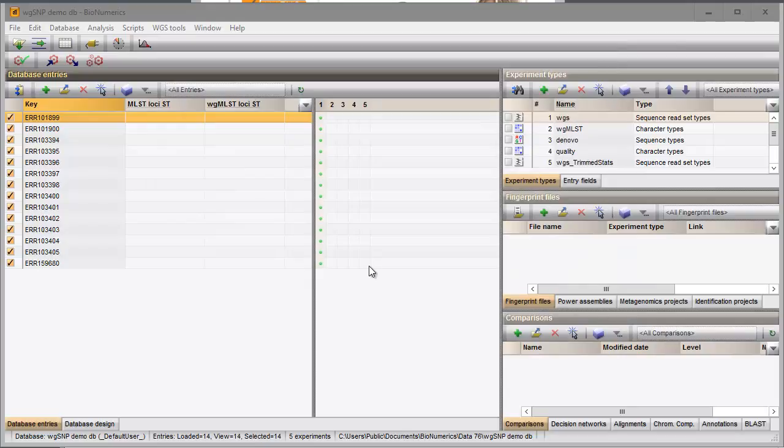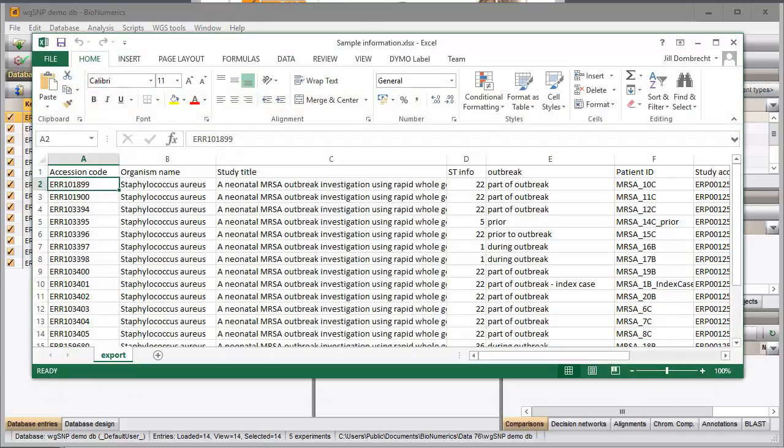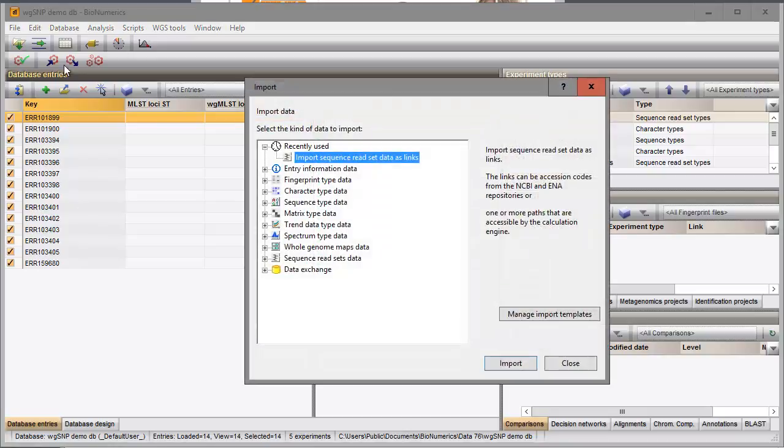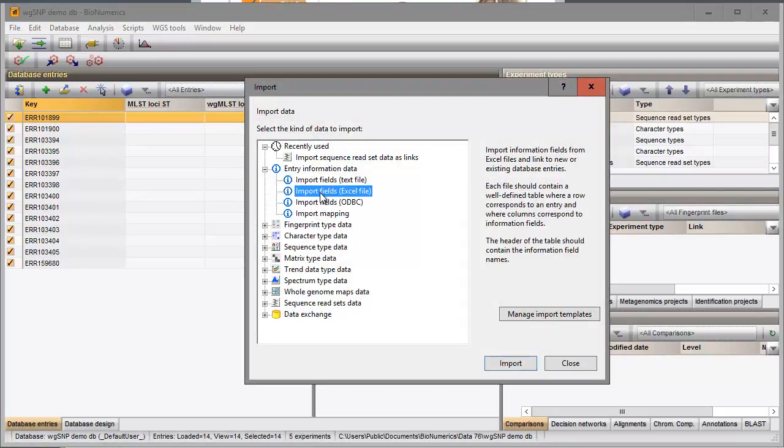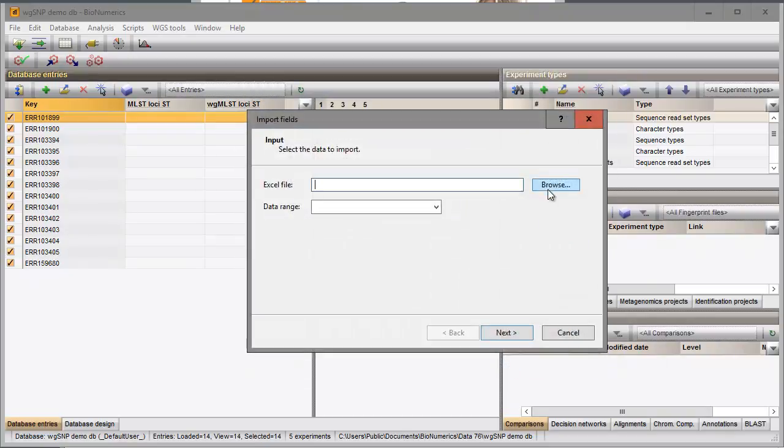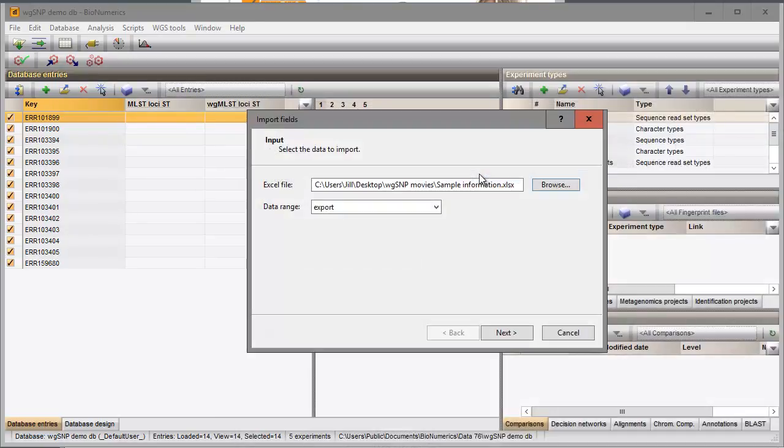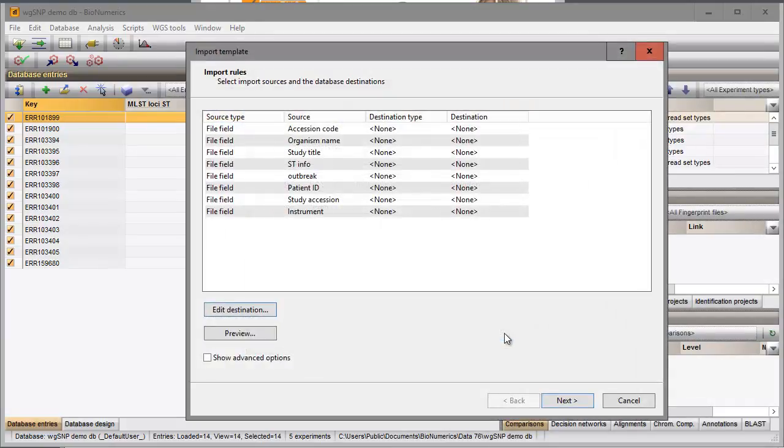For all 14 entries I have additional information stored in an Excel file. I will import this information in my database. I go to the Import Tree again and I select the Excel Import option under Entry Information Data. I browse from my Excel file and I link the Accession Code column in my Excel file to the key field in my Binumerics database.